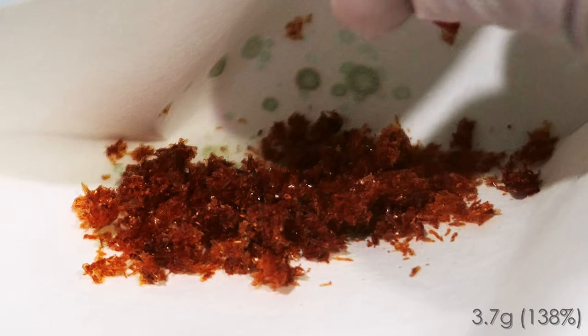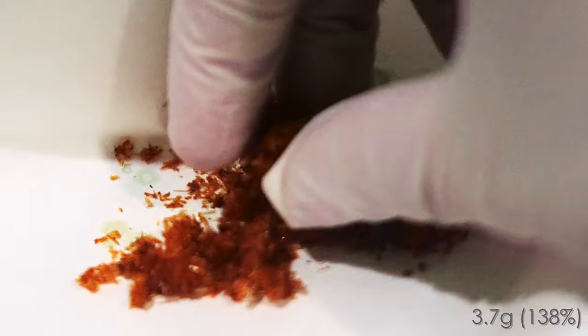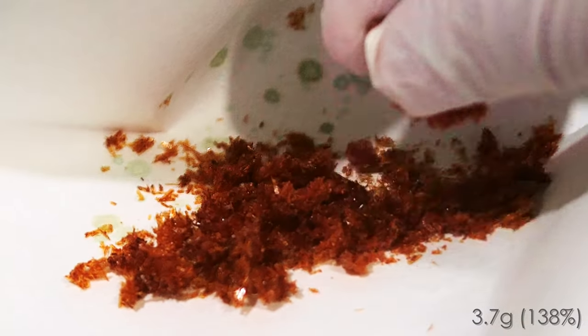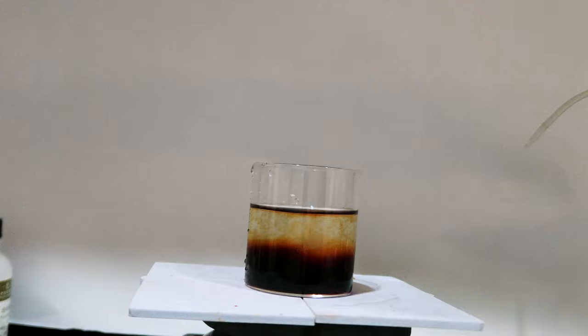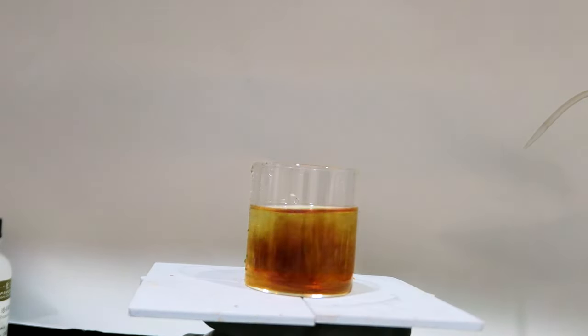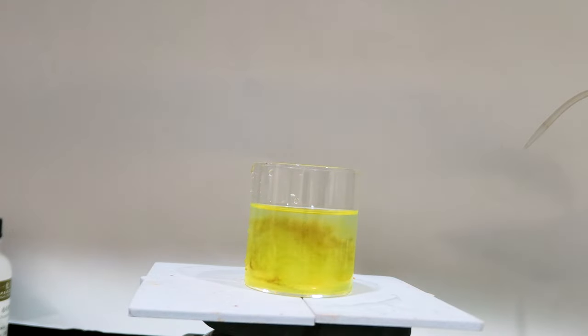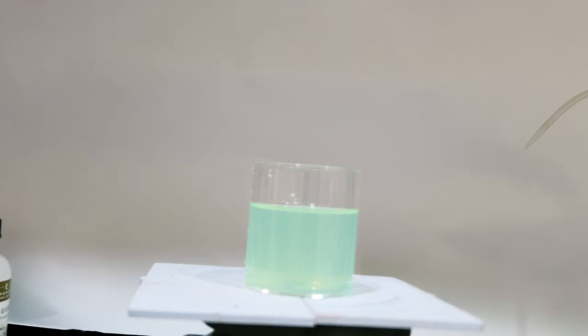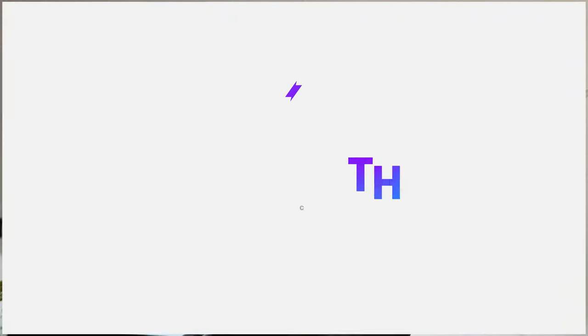To demonstrate that this is indeed a copper(III) species, a small amount of crystal is dissolved in water, and sodium metabisulfite is added, and the color fades away instantly. This indicates that the copper is in a higher oxidation state. That brings to the end of this video.